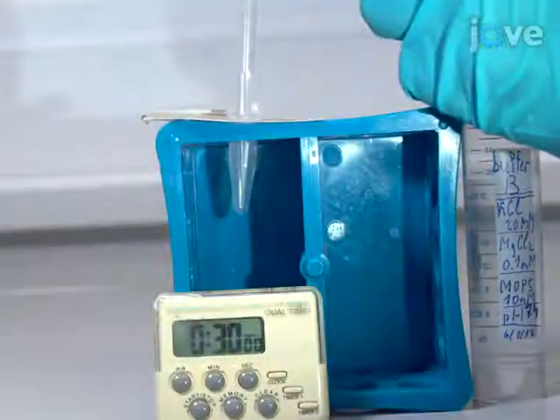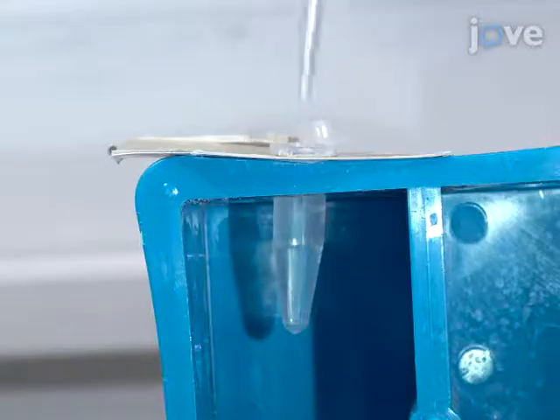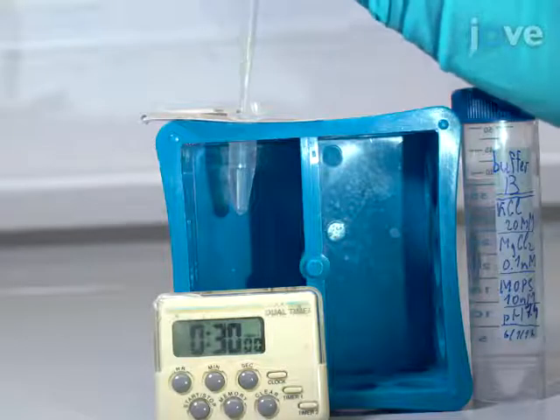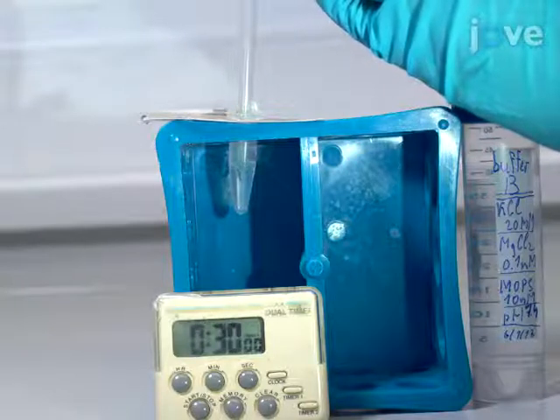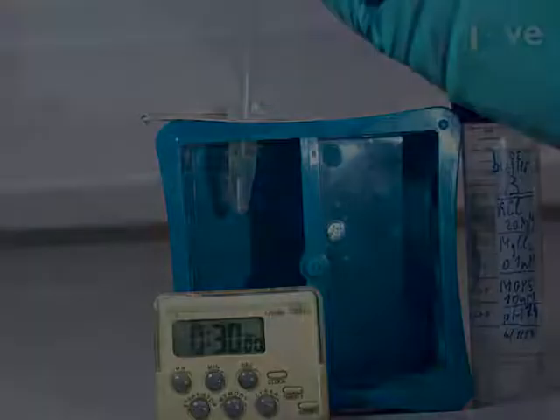Next, to form the lipid monolayer at the lipid-in-oil aqueous buffer interface, take a 1.5 milliliter centrifuge tube and transfer 200 microliters of lipid and oil solution.